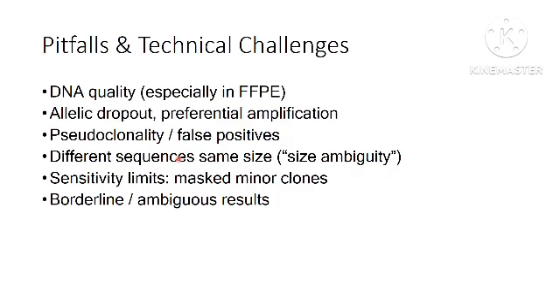Sensitivity limits are obviously there, and you may not always get a proper Gaussian distribution for a polyclonal population, and a sharp spike for a monoclonal population. So in between there are some ambiguous results which you face issues with.